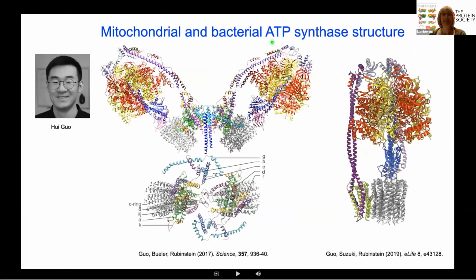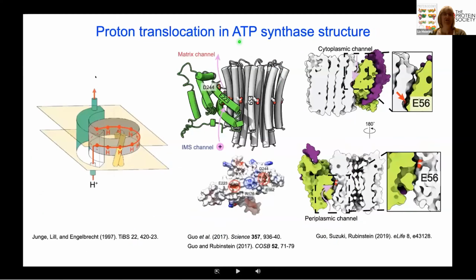Here is the ATP synthase structure. So we had the ATPase, now we're going back to the ATP synthase. And so relative to that blob that I showed you at 32 angstroms, these are the kinds of details that are now known about this machine. And in terms of understanding how this structure relates to its function, we really have amazing high resolution molecular details.